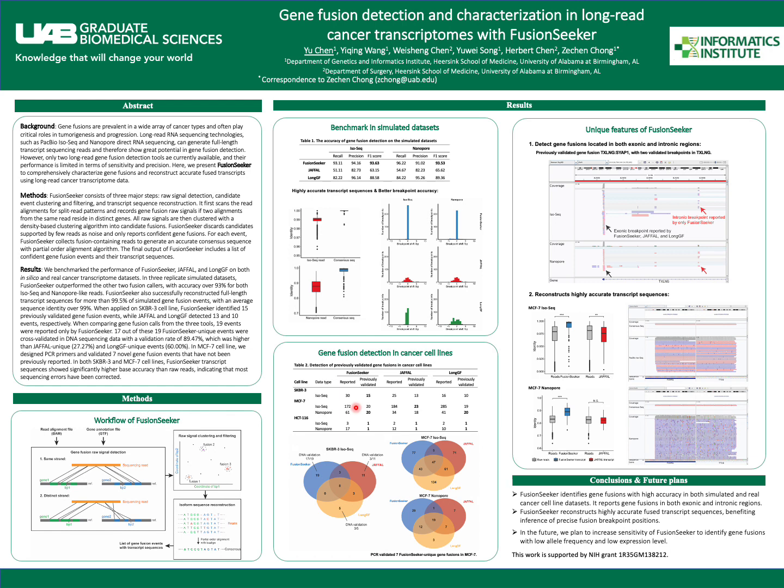And at the bottom, we have the Venn plots showing the overlap information of the 3 gene fusion call sets from the 3 different tools. Some of them can be identified by more than one caller, and some of them are really unique to a specific gene fusion caller. And we try to cross-validate in the DNA sequencing data, and we see that the validation rate is highest in FusionSeeker's unique events, and it is lower here and here.